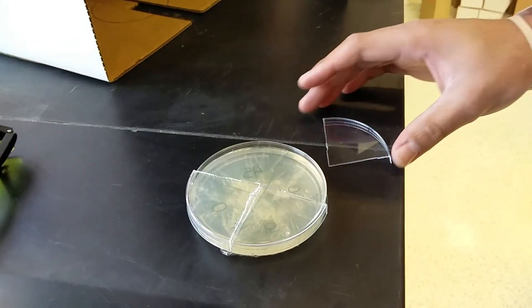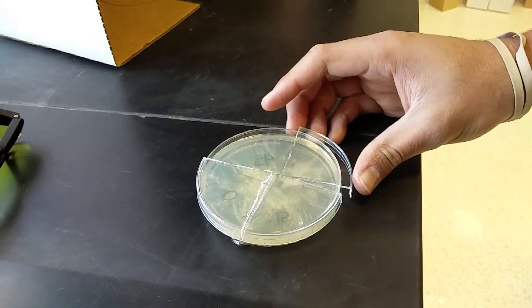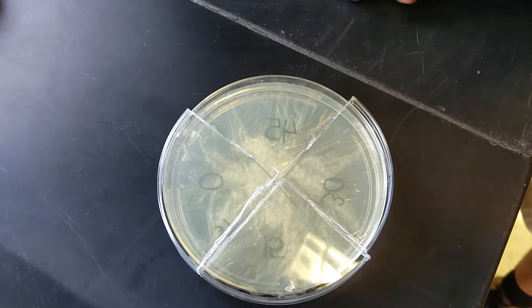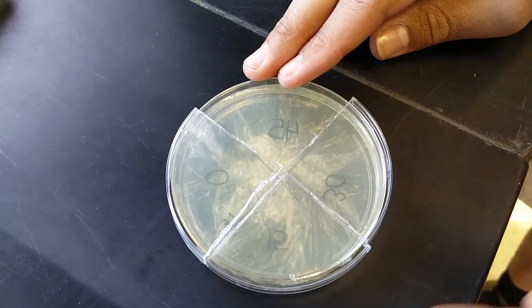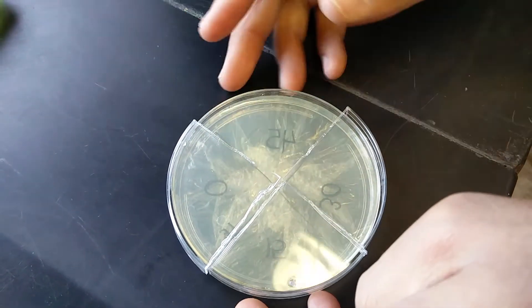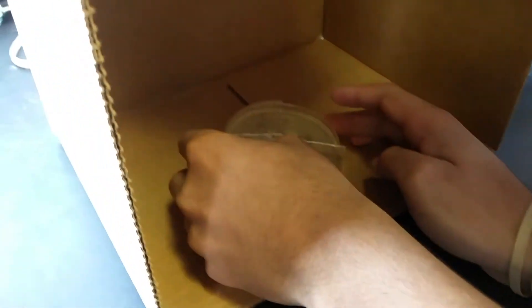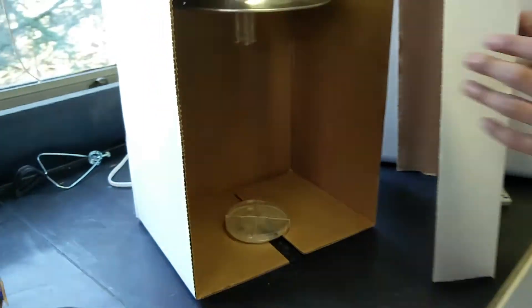As you're about to expose the plate to the UV light, you want to have all the sectors except for the one that you're exposing covered with the petri dish quarters. As you can see, I only have 45 exposed and all the other ones are covered. Now I'm going to take the plate and put it in the center of the bottom of the exposure box.